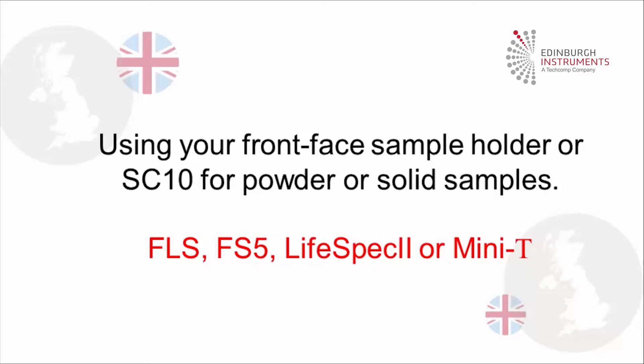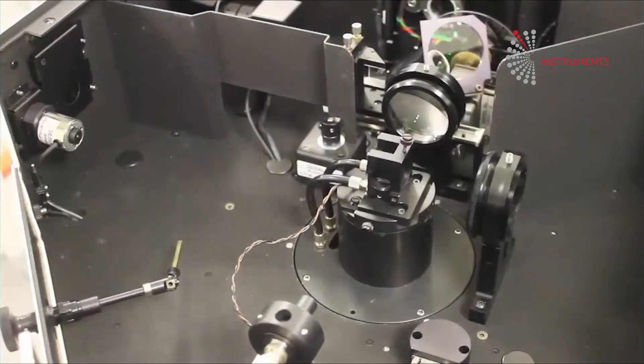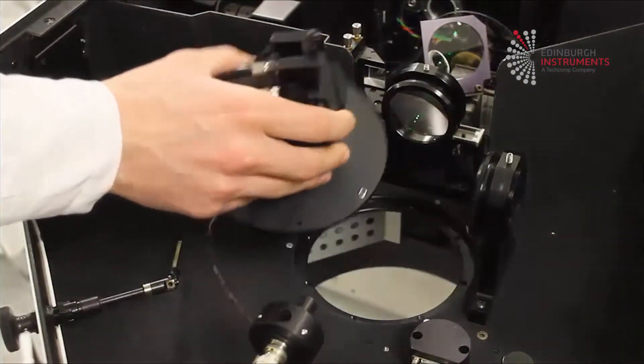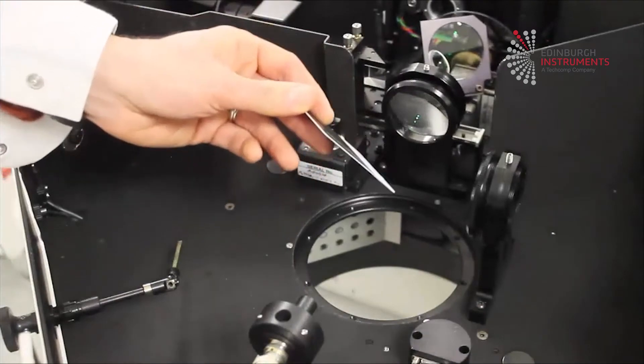Using your front face sample holder on a spectrometer requires more consideration than the liquid sample holder. These considerations can be split into two main areas: sample alignment or geometry, and stray light. The key point to alignment is that the user must move the solid sample plane to meet the intersection or alignment point of the emission and excitation optical axes.